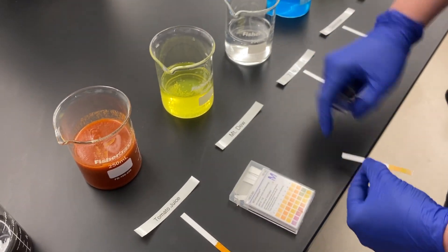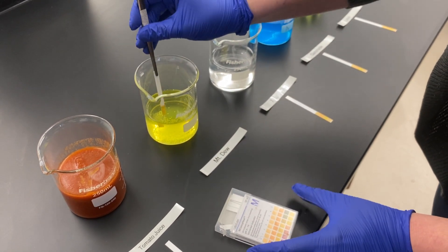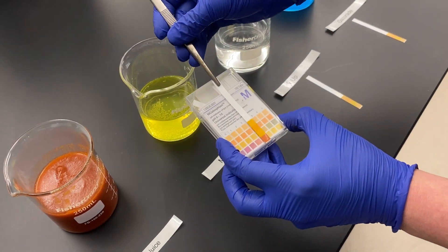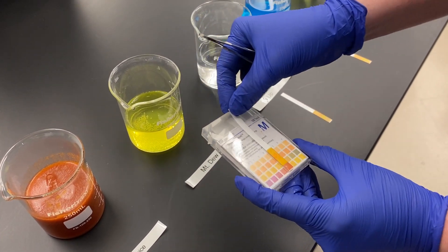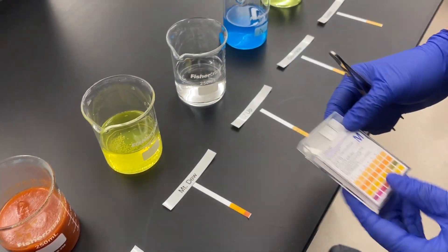Next we're going to test Mountain Dew. If you're a soda drinker you'll be curious to know what the pH of the solution you are drinking is. Mountain Dew is a pH of 3. If you drink a lot of soda that could potentially be a problem, as it could start to degrade your tooth enamel a little bit over time.